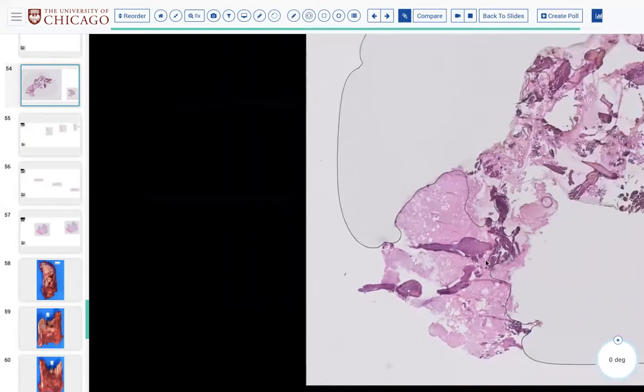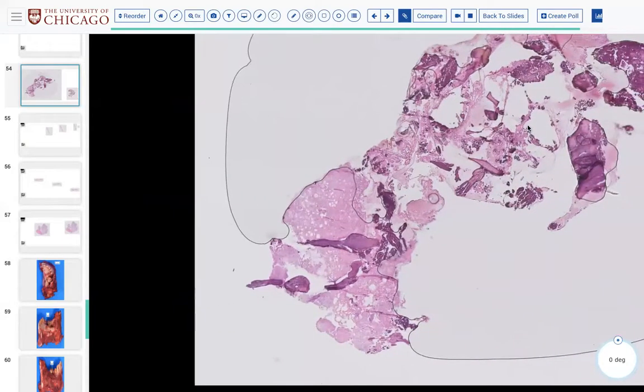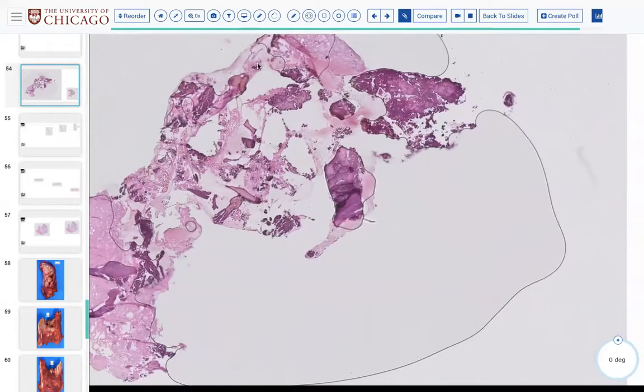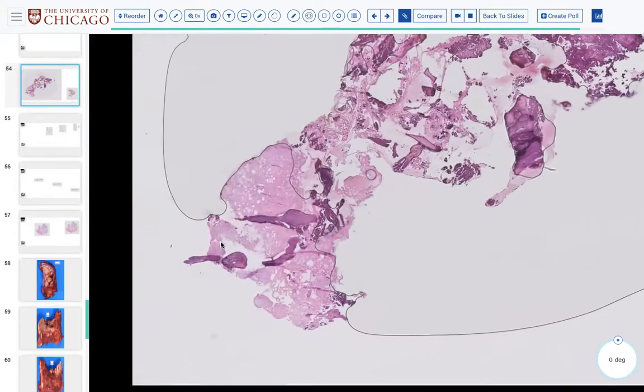But I don't know that I can even give you a straightforward answer on this because this is extremely challenging, right? So if you have a mandible, and they're cutting through it here and here, and here's the bottom of it, and your tumor is invading the mandible, and your tumor is undermining and traveling in either of these directions, it can be positive at any one of these cut segmental marrow margins. Especially challenging in this case if it's extremely well differentiated.